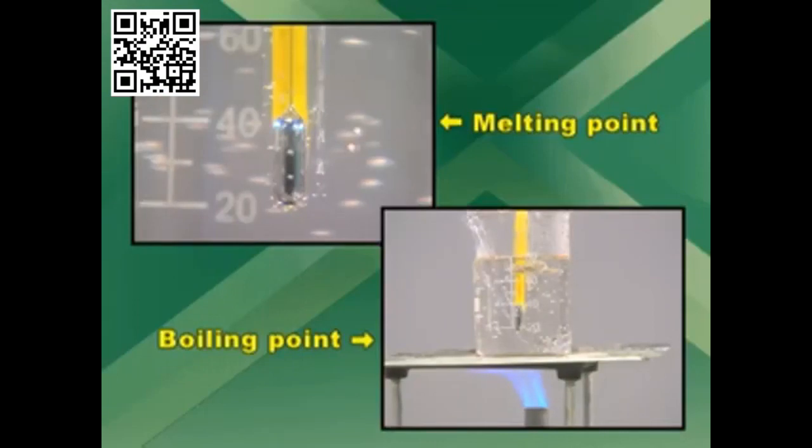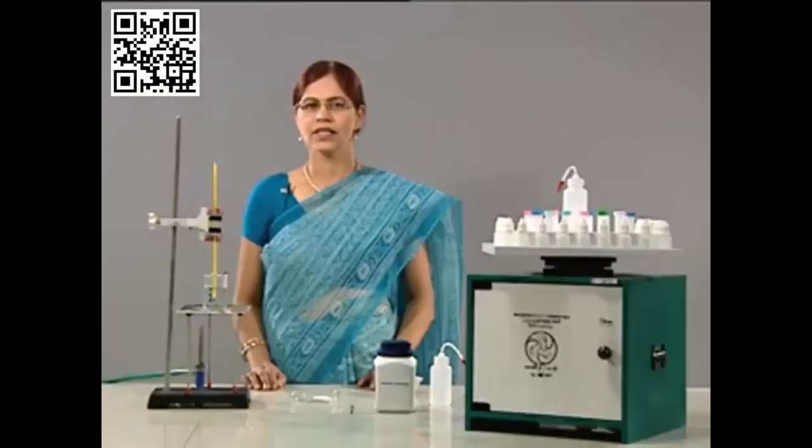After measuring the physical constants like boiling point and melting point, next we'll take up crystallization.